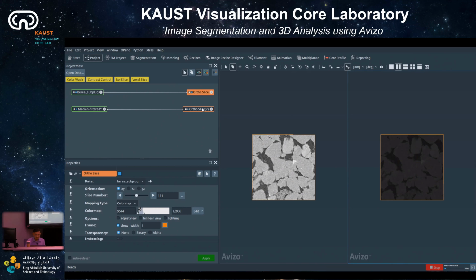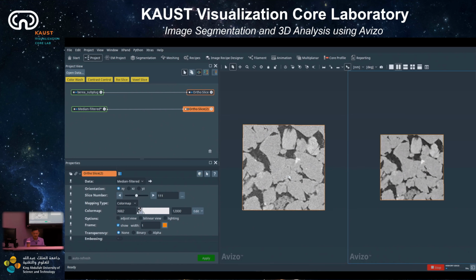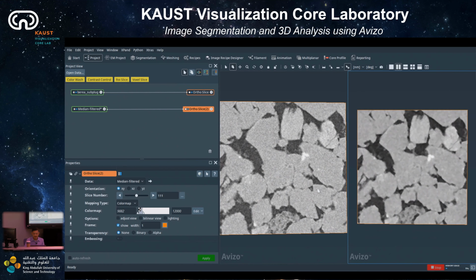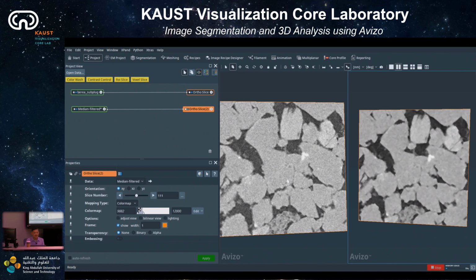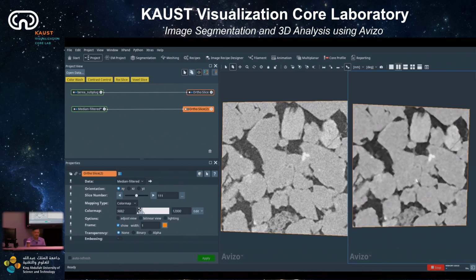Well, and this one also goes to 12,000. Value of intensity. And then if you zoom in here, you can see that on the right is the zoom data. To be able to see that, you need to look at when you activate two viewers.